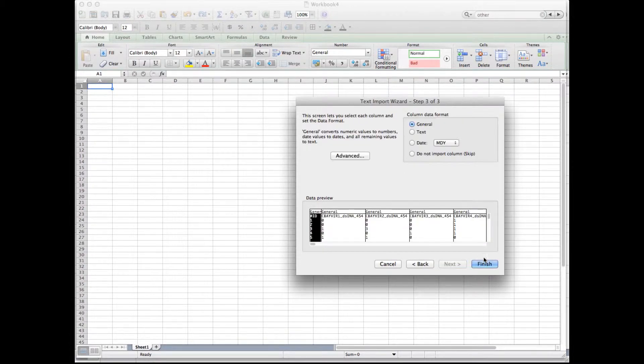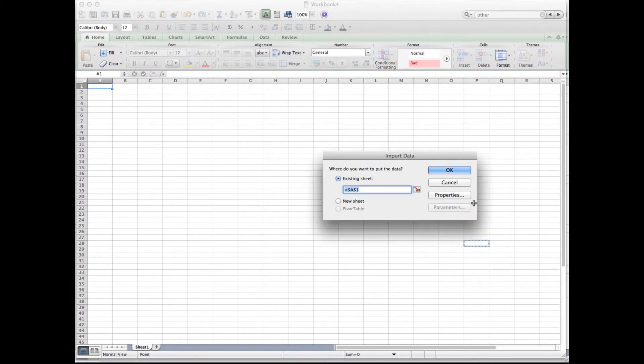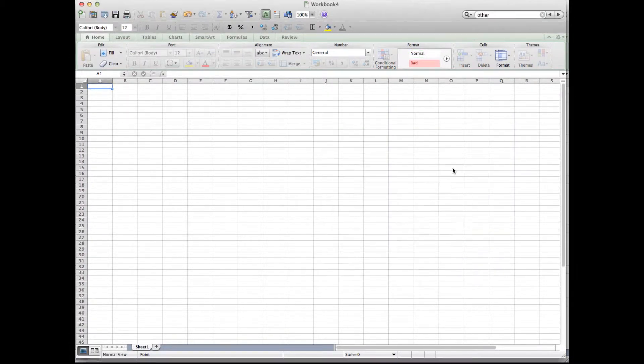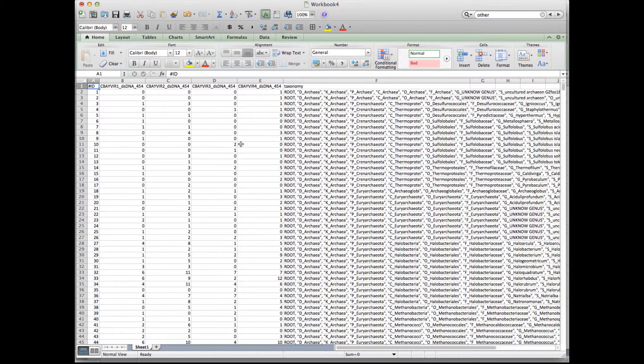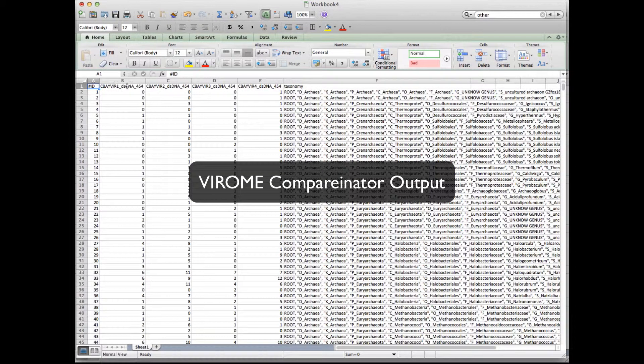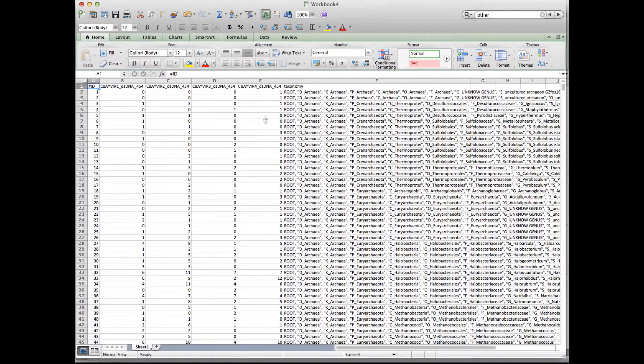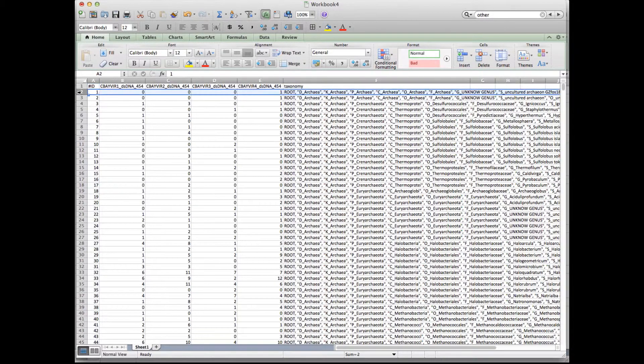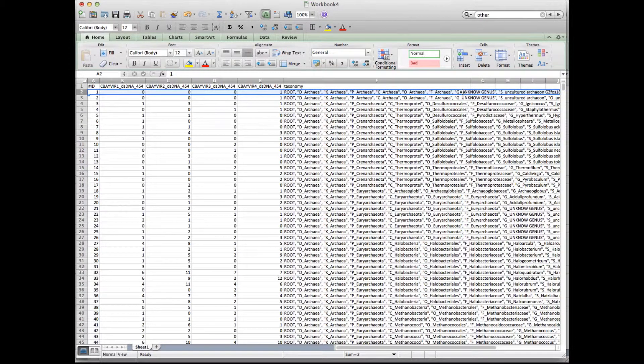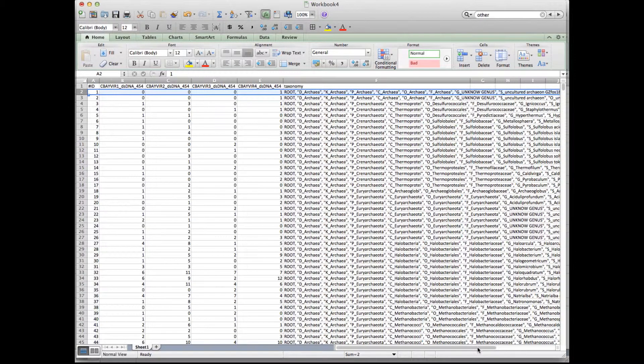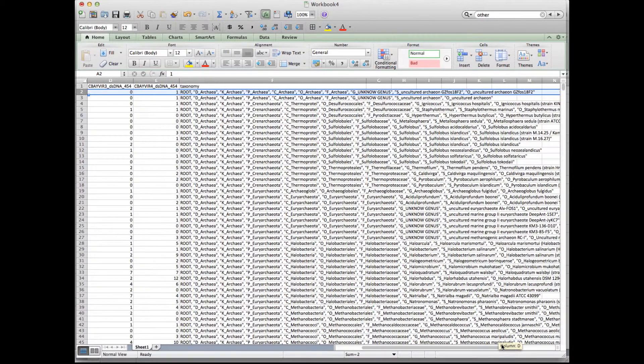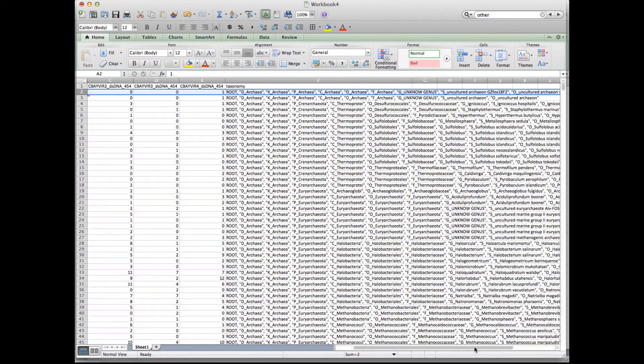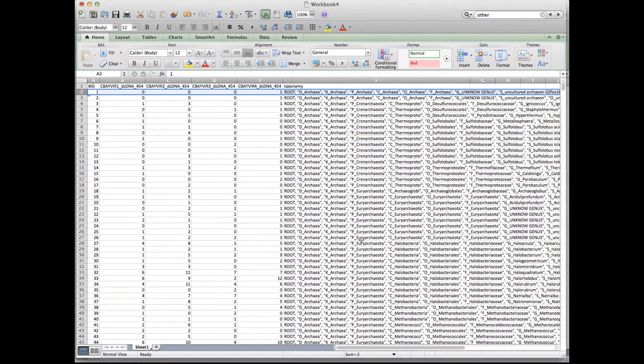You can see that each of the columns is selected properly. I click next, then I click finish. And you'll see this is the output of the Comparinator, where the four libraries are listed in the column. These are the raw counts. And then this is the taxonomic string of the hits against those libraries.